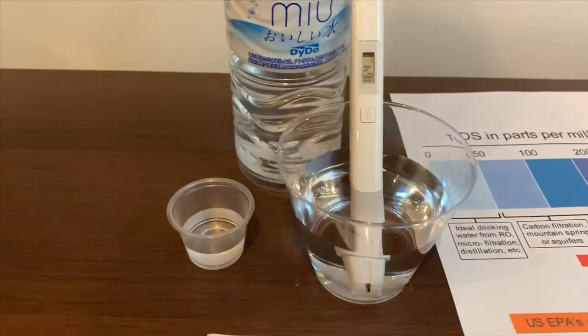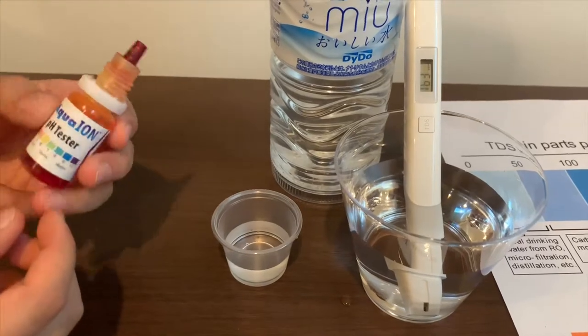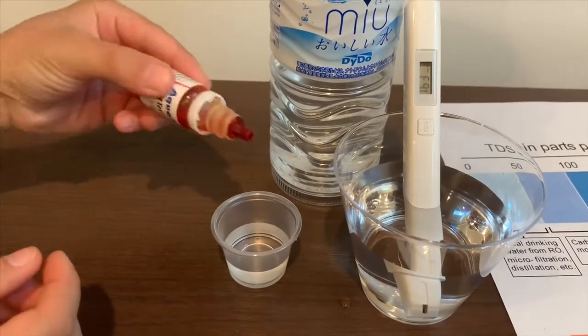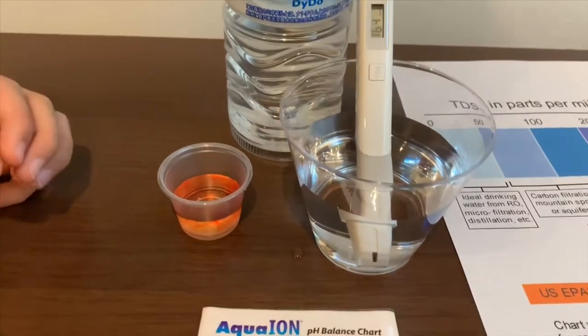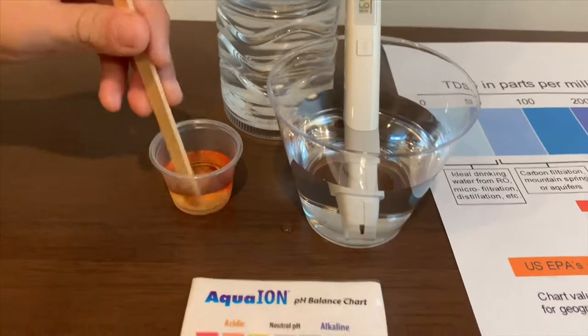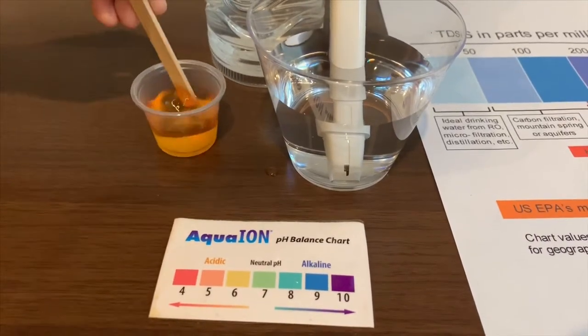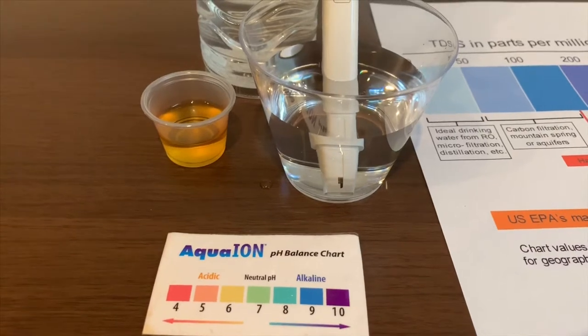Now let's test the pH level. If you want to buy this pH tester, check the link down below. Only do two drops. Let's stir it a little. I give this a 5.5 — this is acidic.